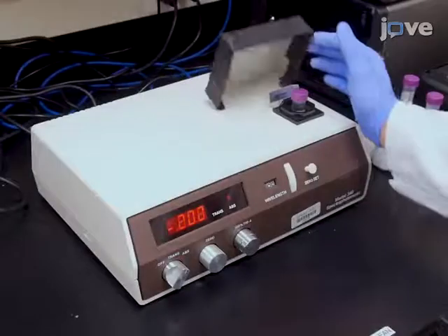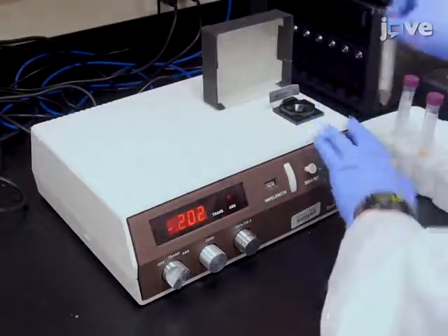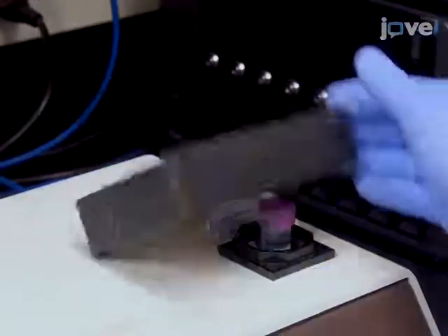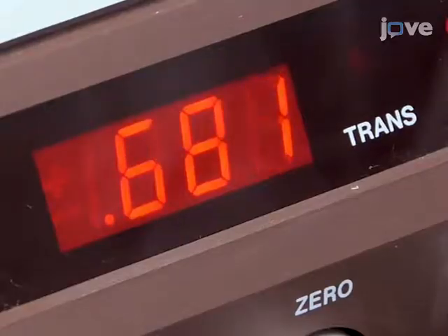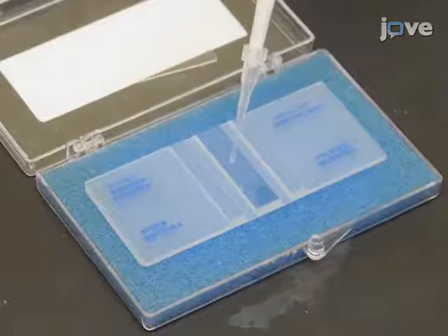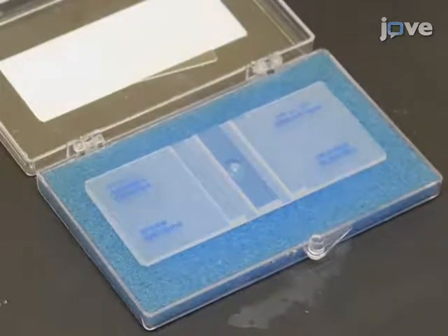To begin this procedure, on the day of the experiment, take a spectrophotometric reading of the bacterial master culture, which is expected to be in the range of 0.6 to 0.7. Then, take a sample of the master culture and count the cells directly using a Petroff-Hauser counting chamber to enumerate both live and dead cells.